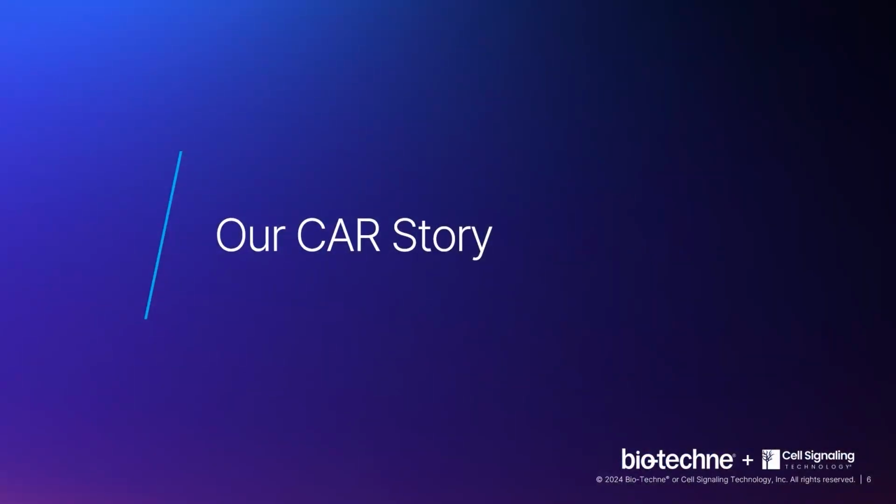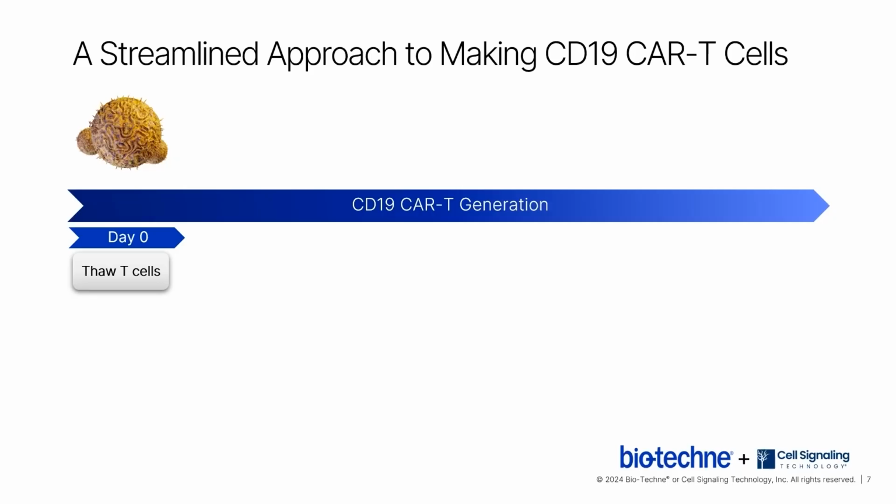Thanks, Rick, for the background. I'm happy to introduce our CAR story and how we made the CD19 CARs. Rick gave a great introduction to really set up the importance of CAR T cells and therapy and some of the challenges with detecting the CAR linkers, as well as the importance of looking at signaling events. I'm going to walk us through a streamlined workflow for the generation of CD19 CAR T cells from primary human T cells in under 2 weeks.